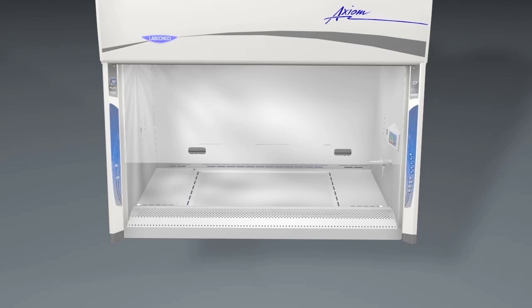However, the Axiom's three-piece work surface and chemical work zone is unique.